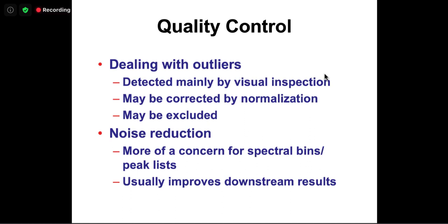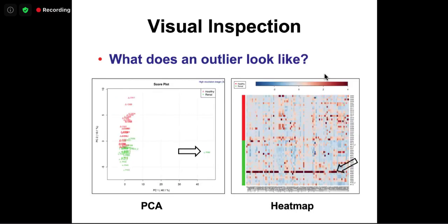So if you test, say, 1,000 features, you're going to adjust 1,000 times. If you have 500 features, you adjust 500 times. There's a huge difference, so the penalty is different. Reducing the noise helps not only the p-value calculation, but also enhances a lot of other signals. Most likely what gets removed is low signal close to baseline.